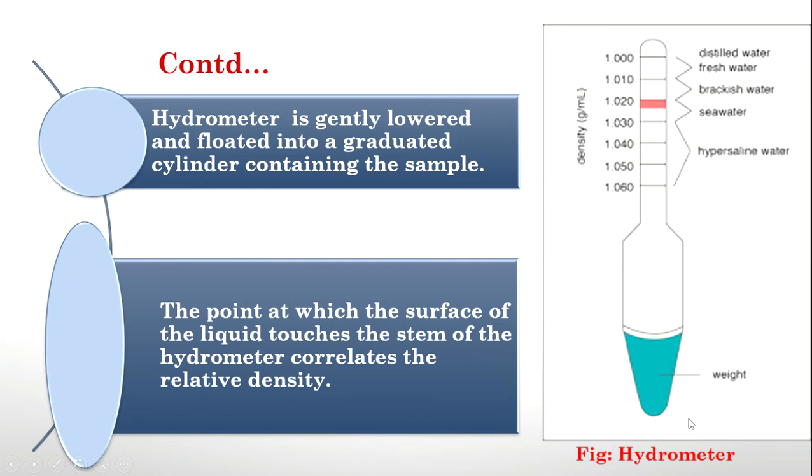This hydrometer will be inserted in water. It will float in water, and if the water is not good for health, it will be immersed a little.